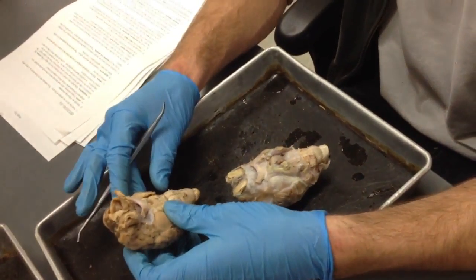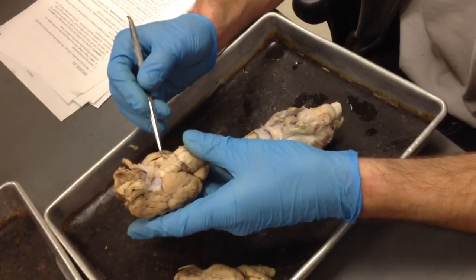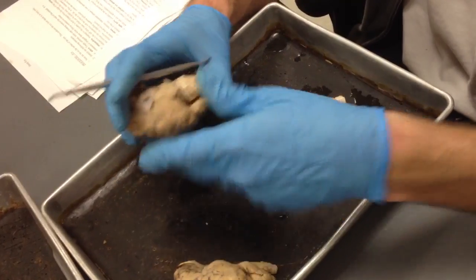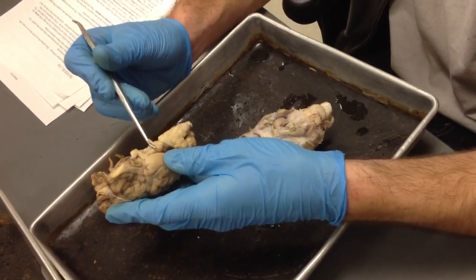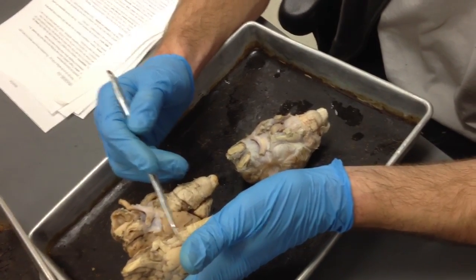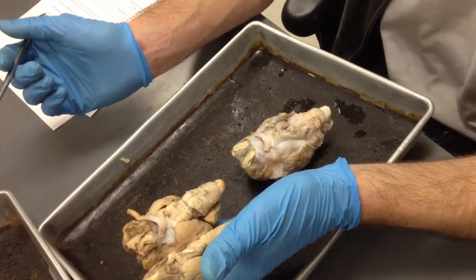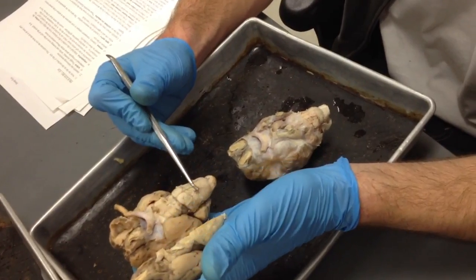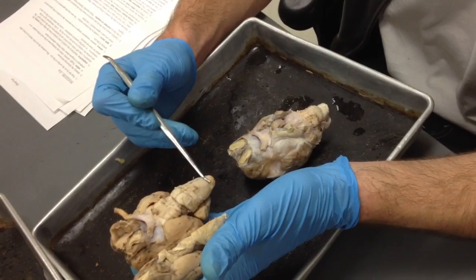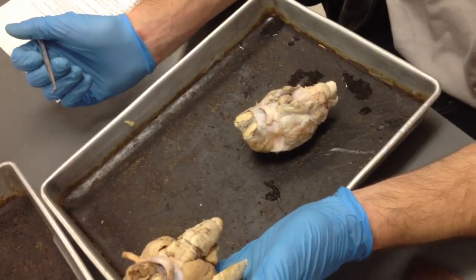Okay, the oculomotor nerves. So the oculomotor nerves are just behind the mammillary body, or the hypothalamus. So this is your cranial nerve number 3, oculomotor. It's a motor nerve. It's on both sides. So this one's missing, but here's one. Here's an oculomotor nerve. The pons. The pons, okay, that's going to be our anterior part of the hindbrain. And then the posterior part is the medulla oblongata. Pons, medulla oblongata.